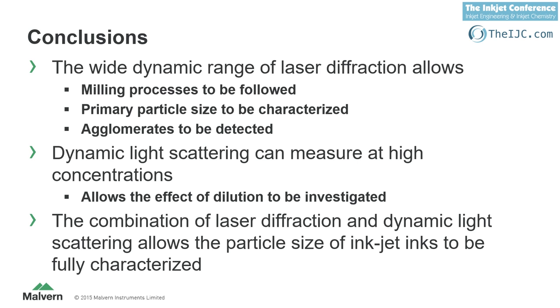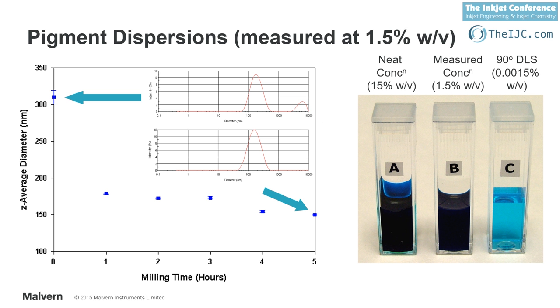It's a curiosity. If you can go back one in the slide, typical DLS patterns, you have a clear signal. And my curiosity is the degree of confidence you have in that distribution, because all these signals are Gaussian, that are not so common in particle size distribution, no? So no doubt about the maximum, but what is the confidence on the width of these bands?